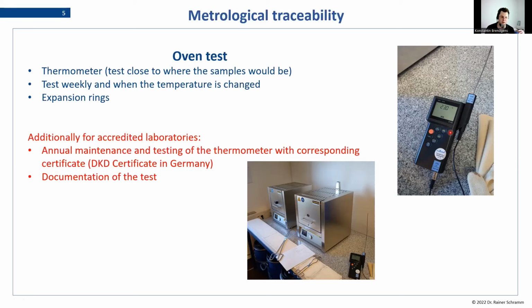We always have one in the laboratory that we use, and then the other one we can send out for the annual check, and we get it back with the new certification. And again, also documentation of the test needs to apply here.